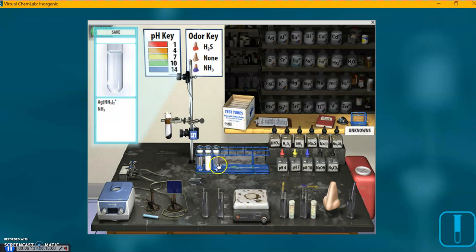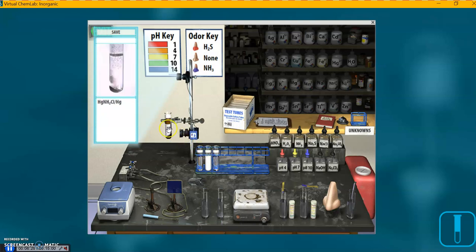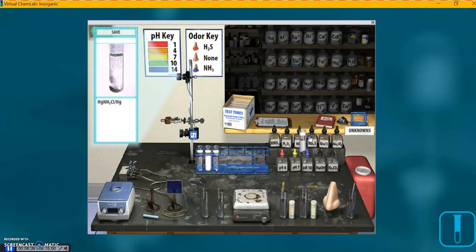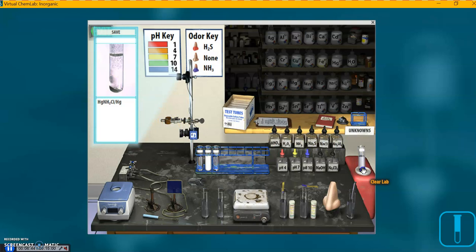This green black solid down at the bottom is the mercury. And I'm going to hit decant again, click that. And notice after a slight delay, we've got our supernatant over here. And as I mouse over it, you can see the silver diamine silver complex ion is in this solution over here. It added some more water to it. And we just have the precipitate still at the bottom. So that is the test for mercury. We've demonstrated we have mercury there, so we can get rid of this.